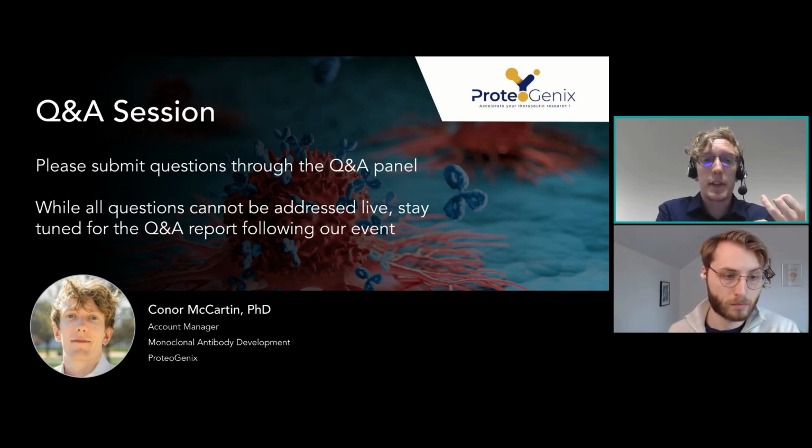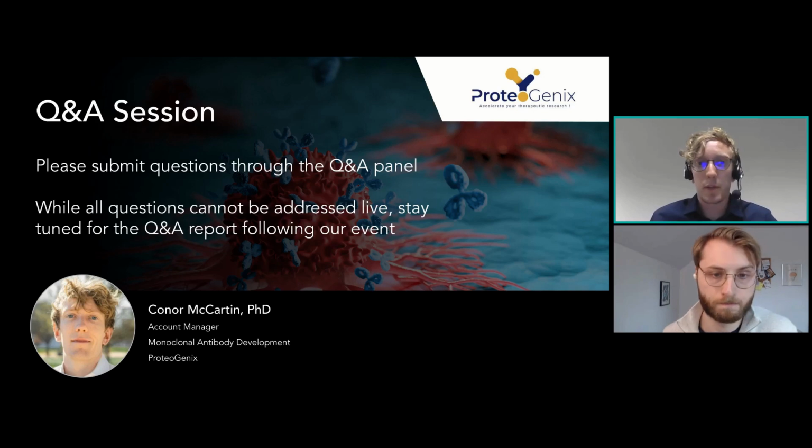And of course, there is essentially no limit to the targets that we can use. So we can also pan against a highly toxic candidate that would be impossible or unethical to inject into an animal.